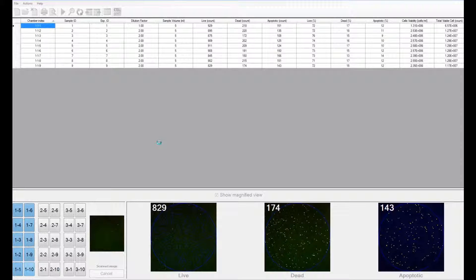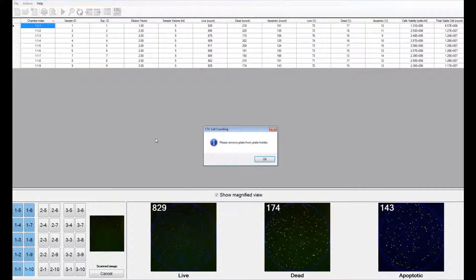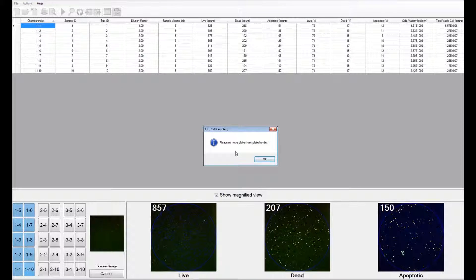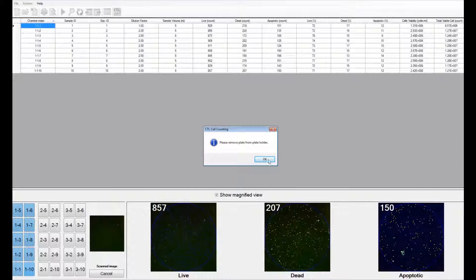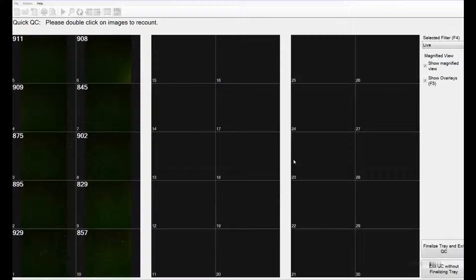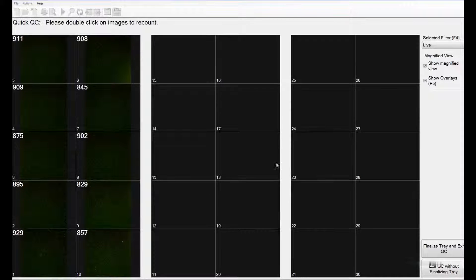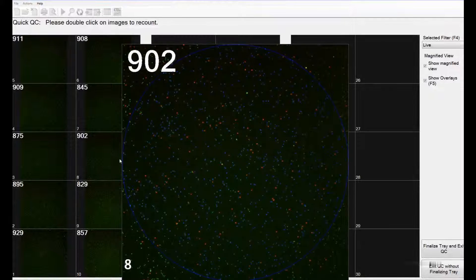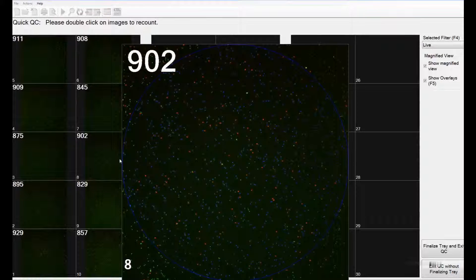Once all the chambers have been counted, you will be asked to remove the plate from the plate holder. At this point, you can add a different plate if you would like. The software now generates an overview of all the images that it had scanned and counted. By hovering over these images, you can see a magnified image as well.